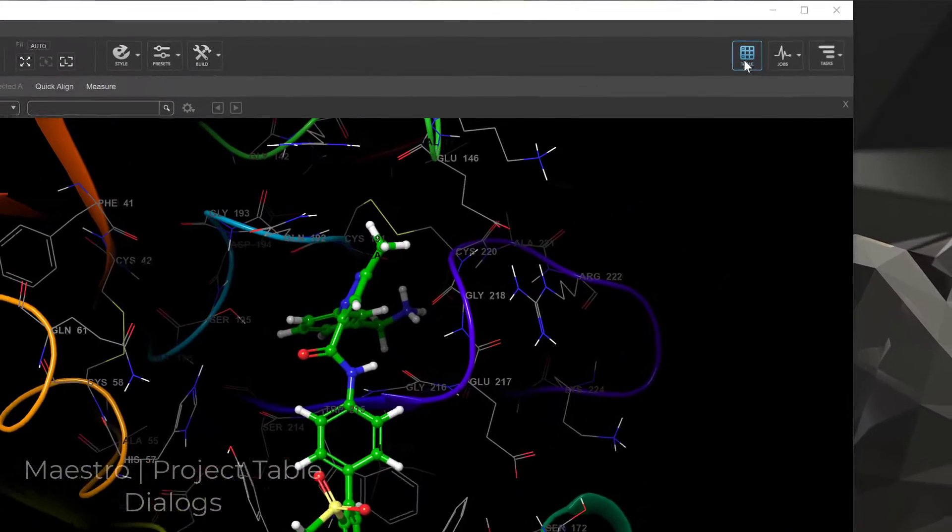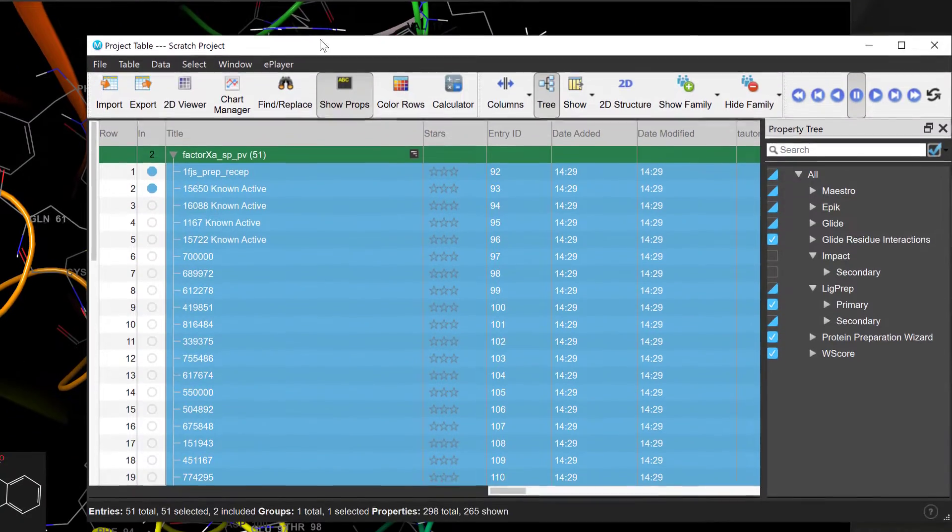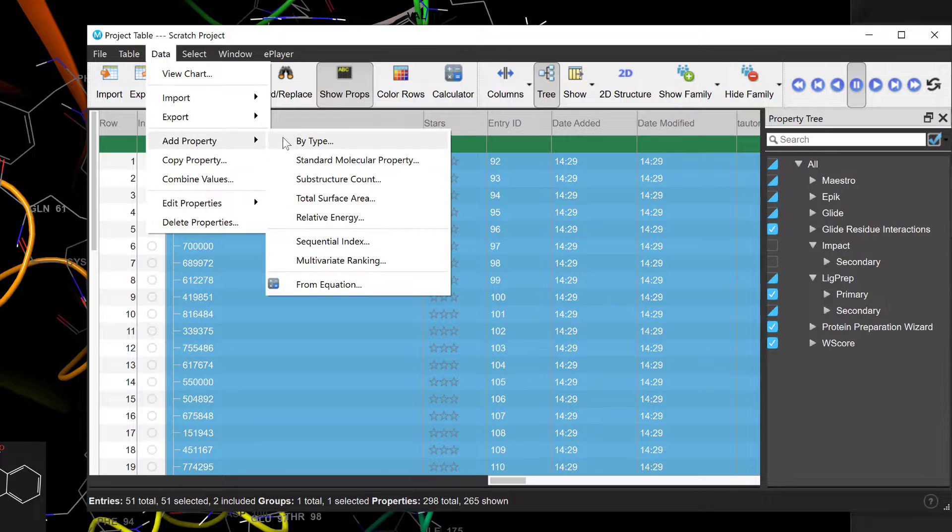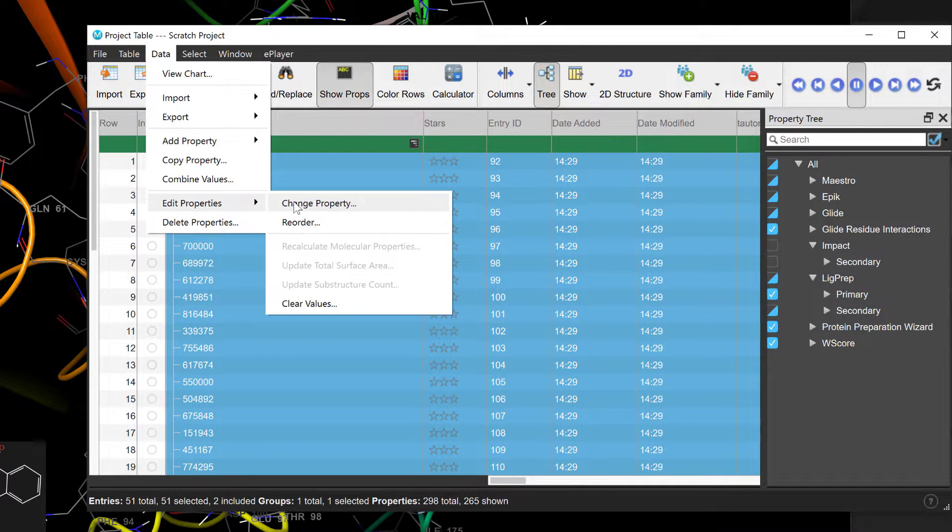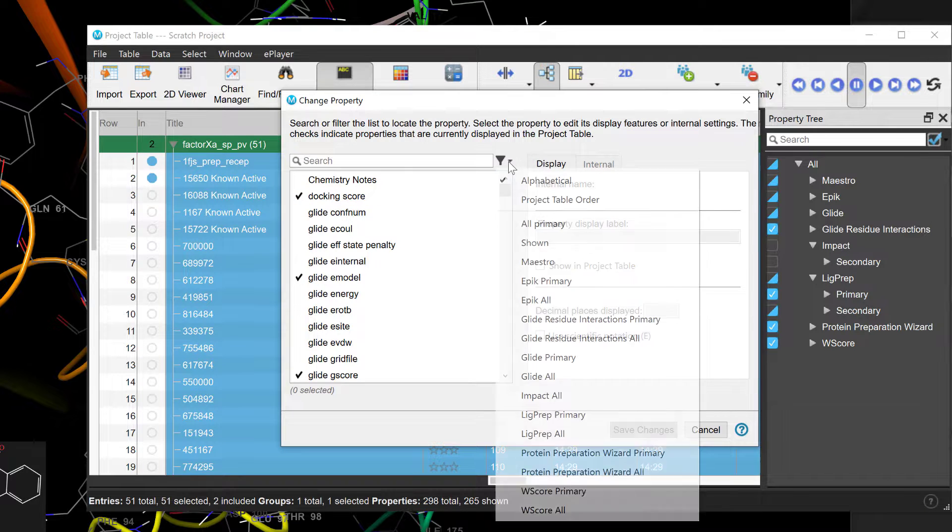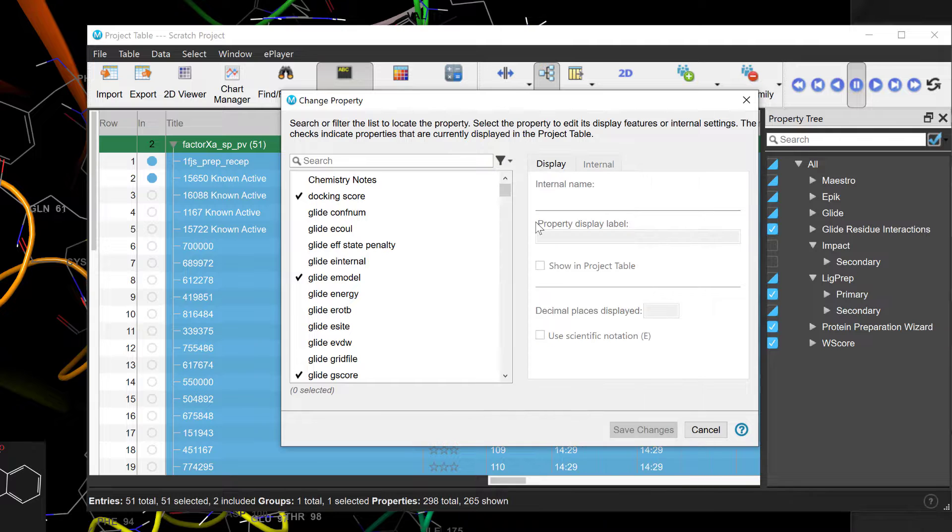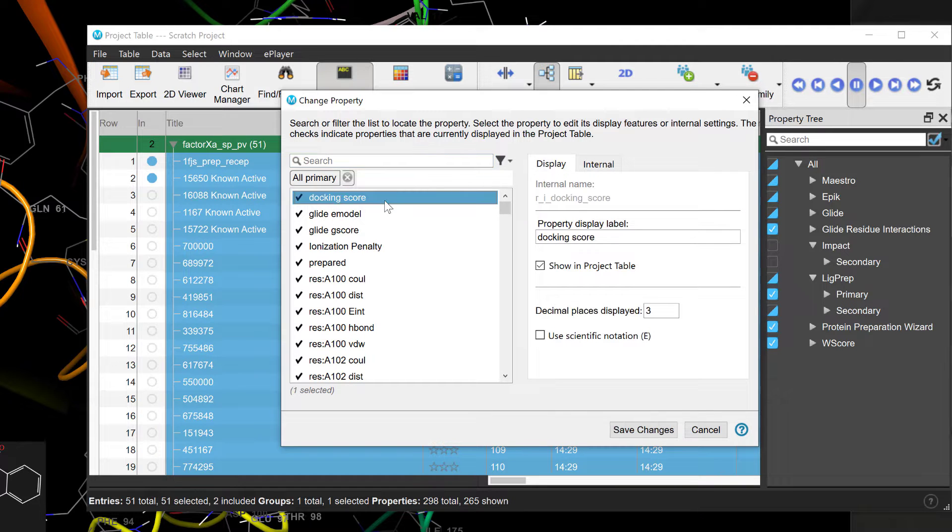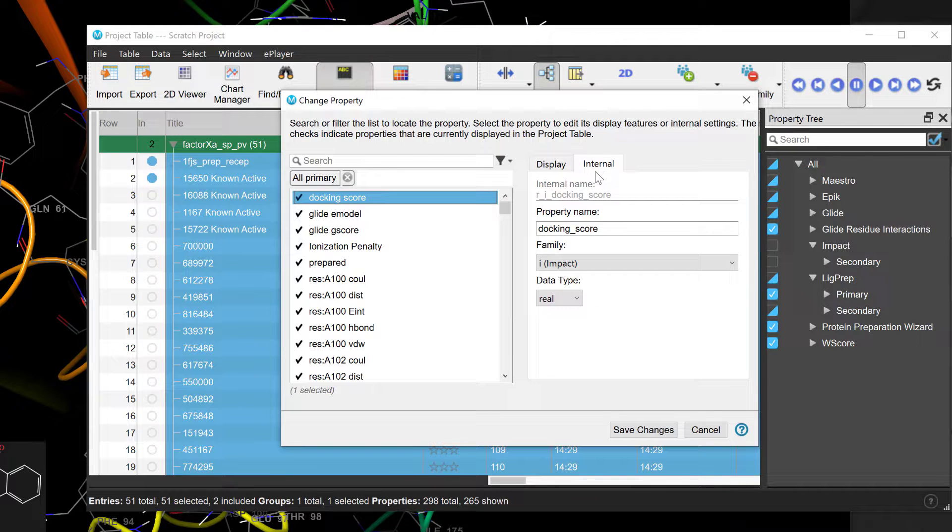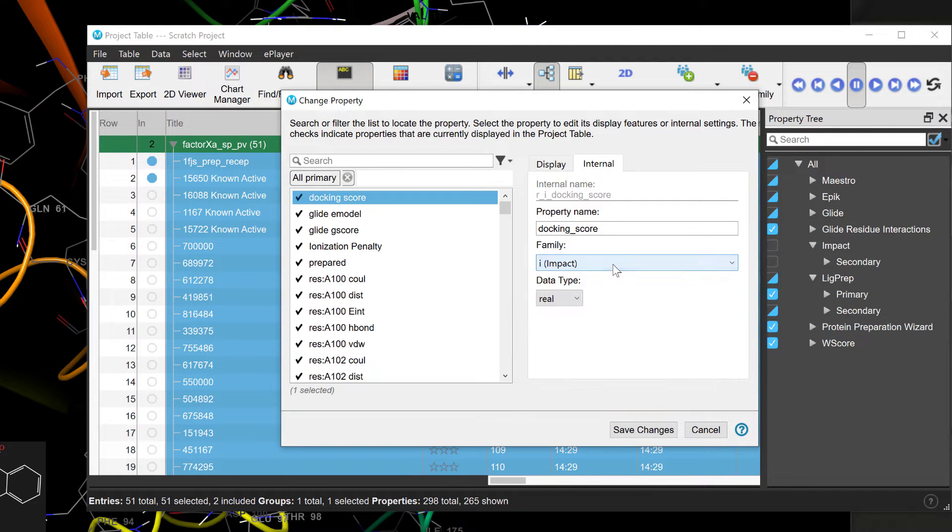In Maestro, continuous UX enhancements are introduced to various project table dialogues. One notable example is the revamped Change Property dialog, which consolidates functionalities of the previous Edit Property Name or Type dialog and the Set Decimal Places dialog. This allows users to efficiently edit and update display features or internal settings in a single, more user-friendly interface.